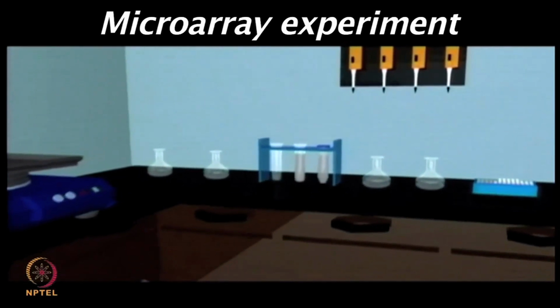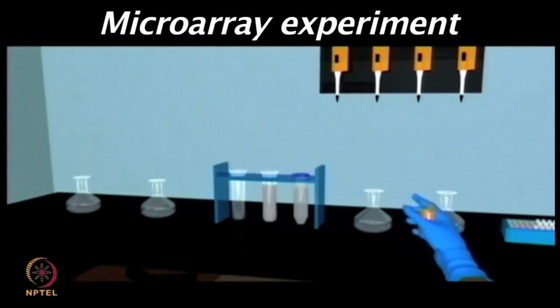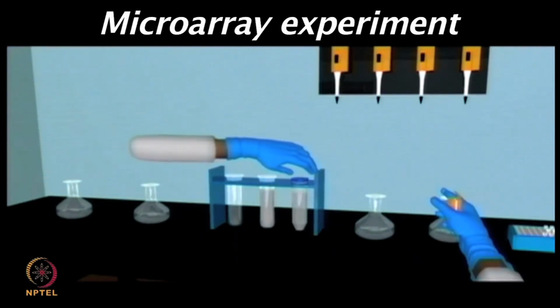This is the typical laboratory setup, where you do not require a very fancy setup, because similar to the Western blot, all these steps can be performed.